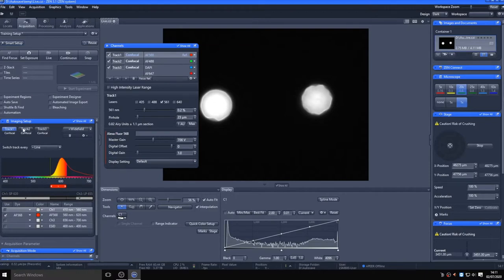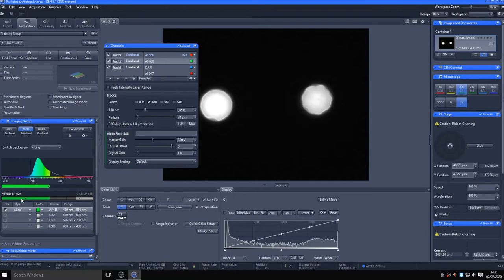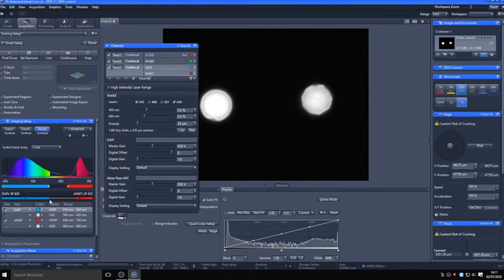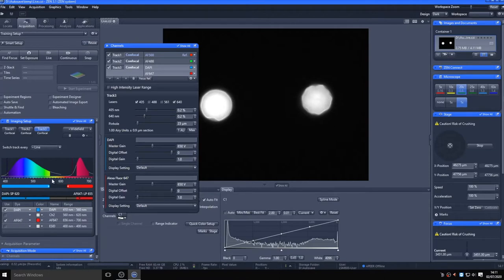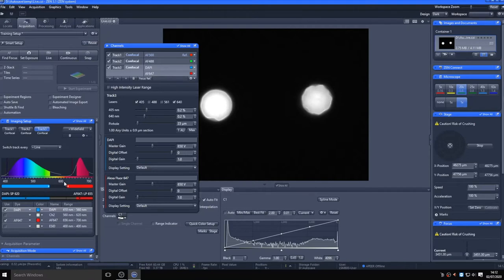Switching to track two, the Alexa Fluor 488 is being directed to the first detector, and all signal from 410 to 560 is being collected. Track three is using detectors one and three to collect the DAPI and Alexa Fluor 647 signals respectively. Notice that as we are in line mode to keep the speed of acquisition up, the dichroic sliders are left in the same position between tracks and the lasers are toggled on and off.